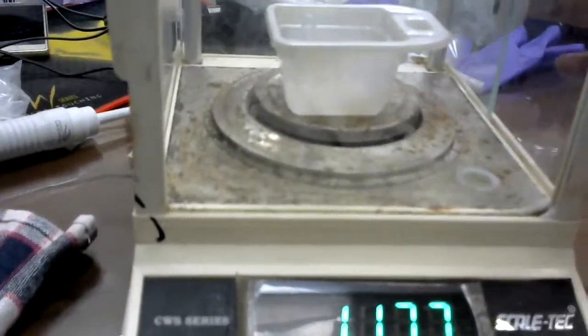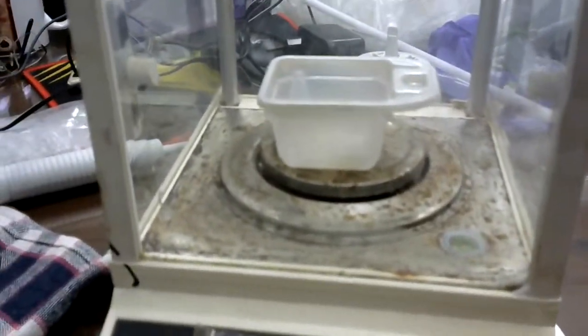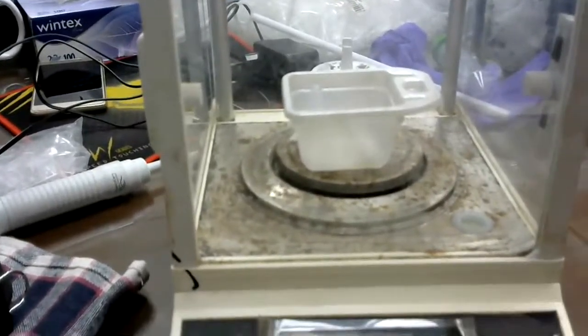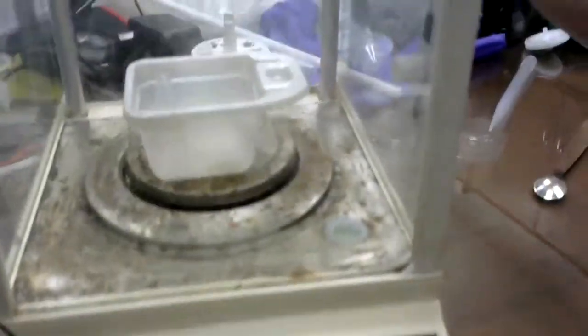And see, this is a glass chamber, made so that while weighing, if a fan is running or some air is blowing, it is not going to disturb. That is why the whole chamber is there.